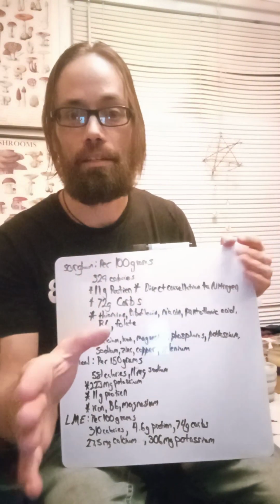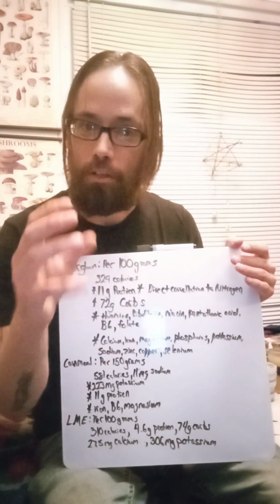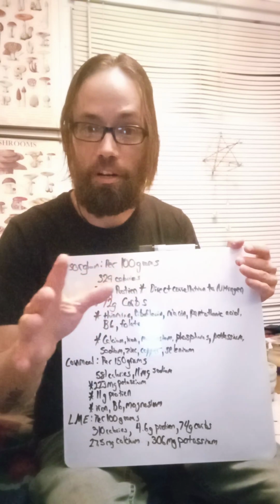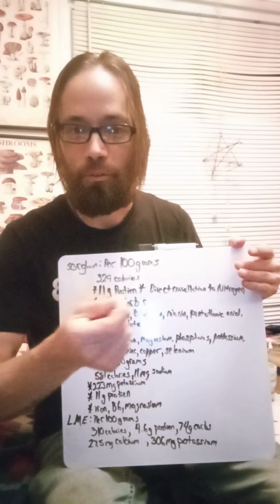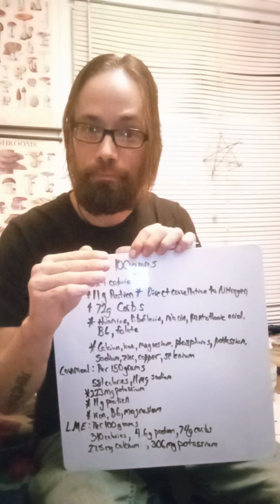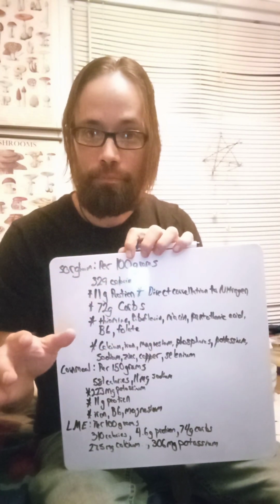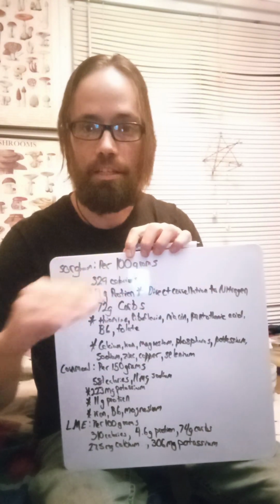But back to that. The plates I poured with the cornmeal that went directly into it, every single plate, but like 2 or 3 out of 20, went bad and ended up with little yeast spots all over it. And I cooked all 5 bottles together, all of them the exact same way for 1 hour, like I always do. Every bottle, all 4 other bottles, poured perfectly, not a single bad plate.